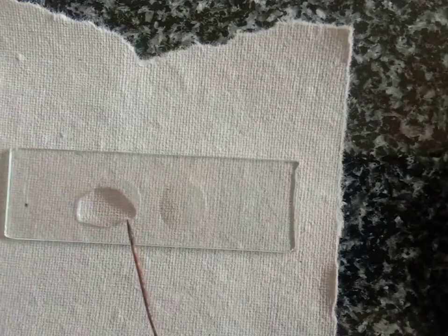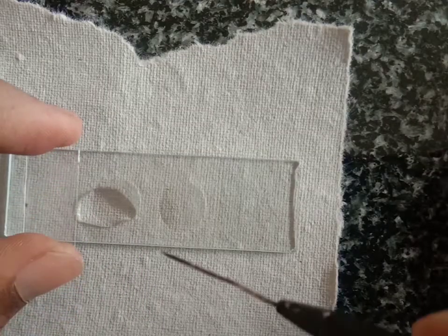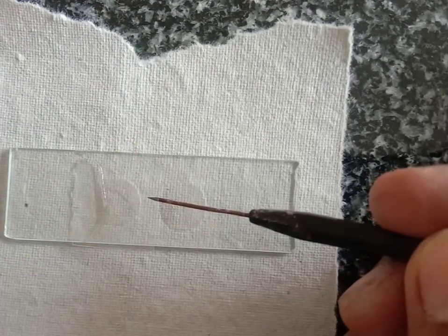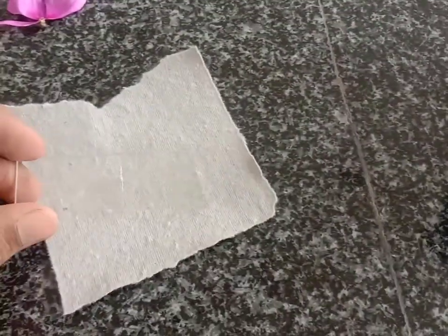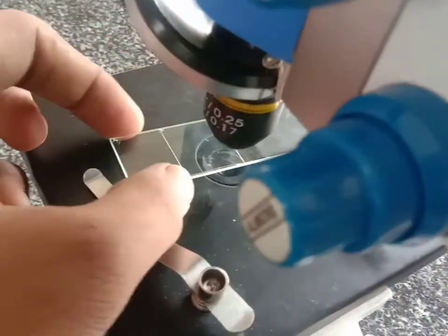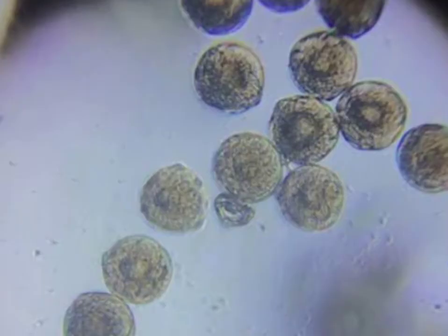After dusting the pollen grains, put a cover slip on the slide with the help of a needle. Put the cover slip on and watch it under the microscope. When you see the pollen grains, count and note down the number of pollen grains observed in a tabular column.